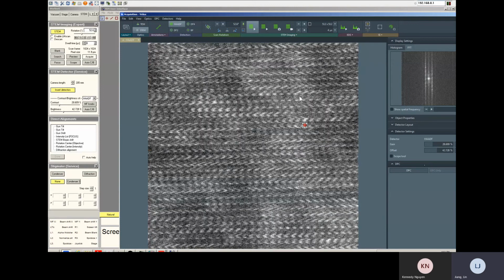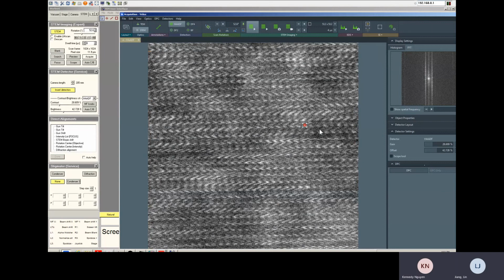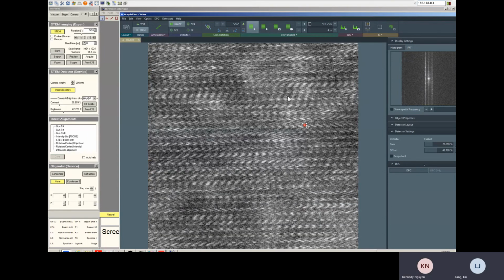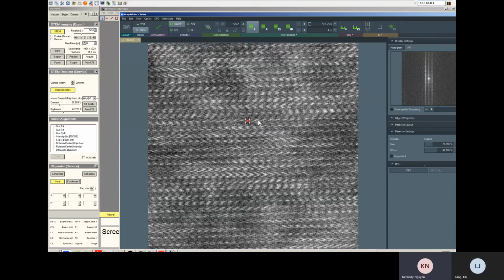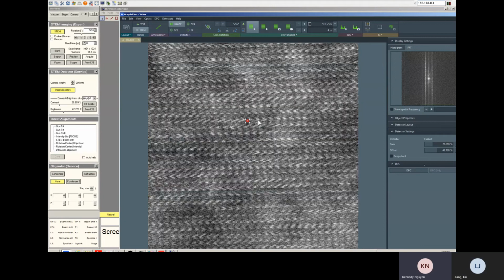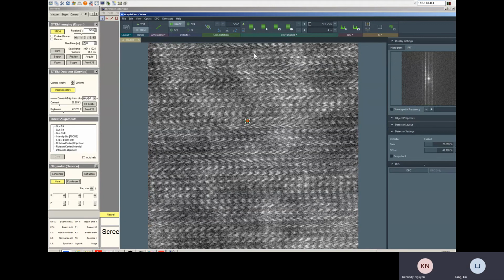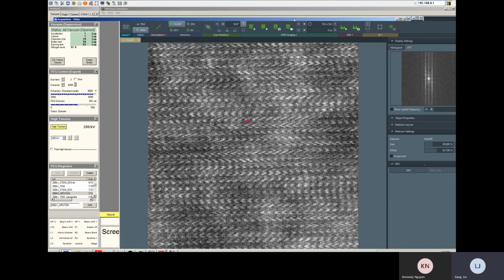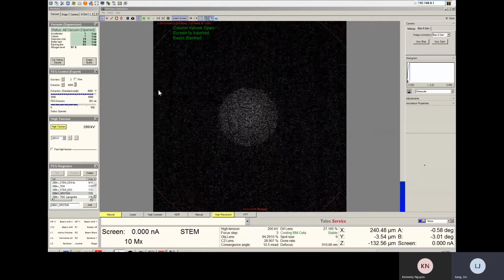See now, as I mentioned, there's a lot of vibrating around. So you're so much vibration. So I think that's good. I mean, I get the general idea, okay, what I need to do, and then yeah, we can't look at it because of the vibration. So that's good. Okay. This is basically how we get a good imaging, but definitely we prefer doing high resolution imaging during the night, because there's no construction, no vibrating going around. Okay. So this is basically how we get a good high resolution imaging.